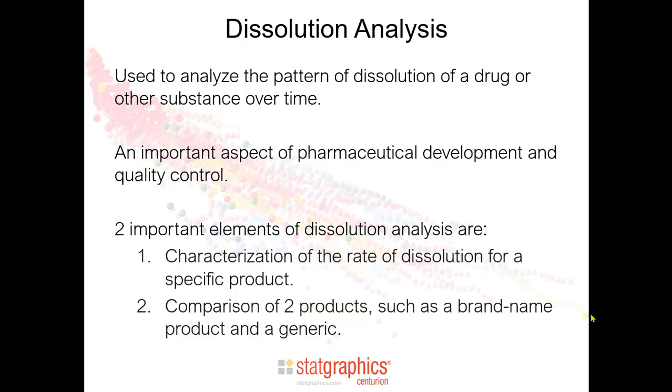There are two important elements of dissolution analysis. The first is characterization of the rate of dissolution for a specific product. The second is the comparison of two products or formulations, such as a brand name product and a generic.